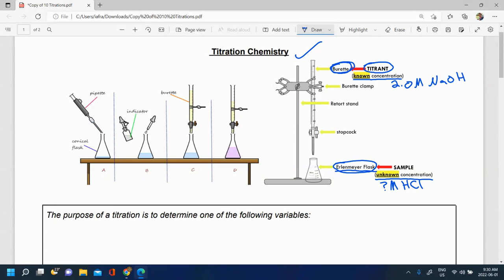What you do is you essentially add this titrant that you know the concentration of to your sample until a reaction happens. You figure out how much of this titrant did you have to add to get a reaction in the sample. Using your knowledge of how much you had to add in terms of volume and stoichiometry, you can then figure out what the mystery molarity of the acid was.